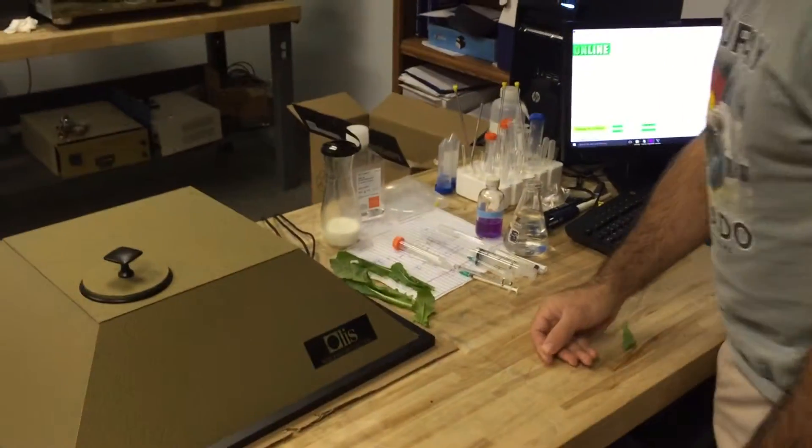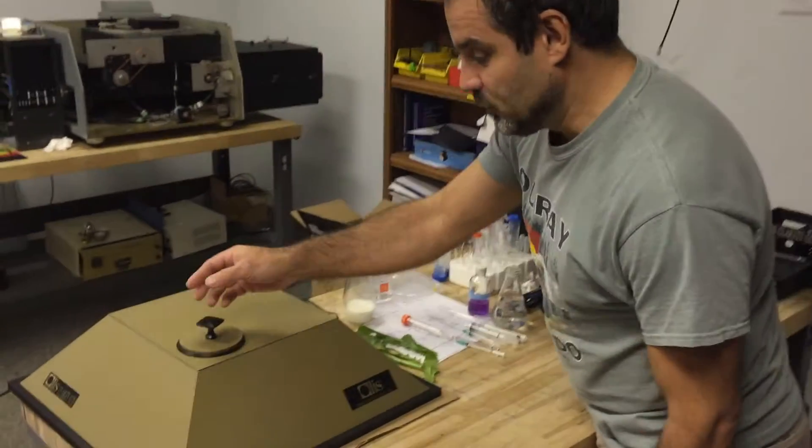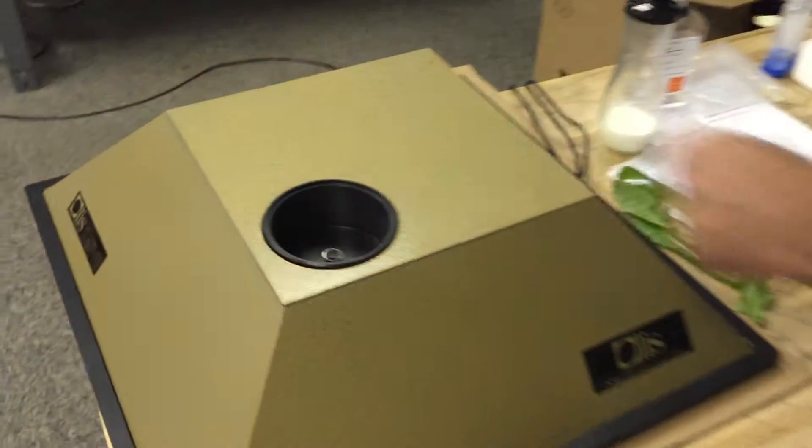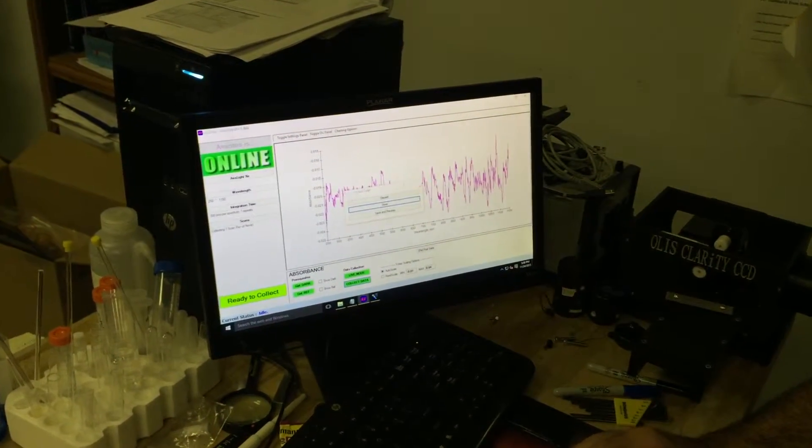This is our clarity spectrum photometer that can take absorbance spectra of pretty much anything. There is an empty chamber, so we are taking the baseline — and of course it's a flat baseline.